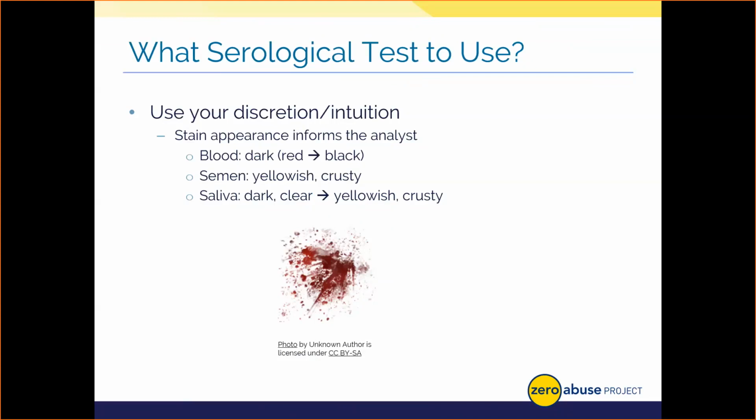Now, semen may be dark and almost clear or translucent even, or it could just be crusty and yellowish or brown, depending on, again, the depositing surface, age, the amount and concentration, and so on. Saliva is kind of a mixed bag regarding interpretation visually. It can be clear, it could be a dark appearing stain, or it might be yellow. All you need to do to look at a saliva stain is perhaps to take your pillow out from under your pillowcase if you need an example.